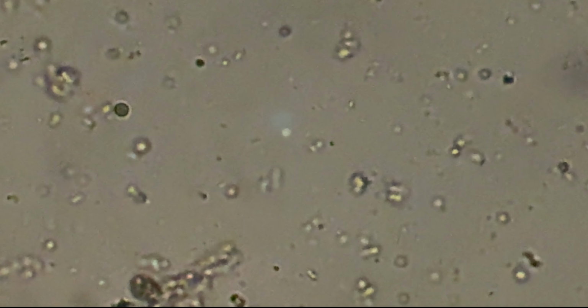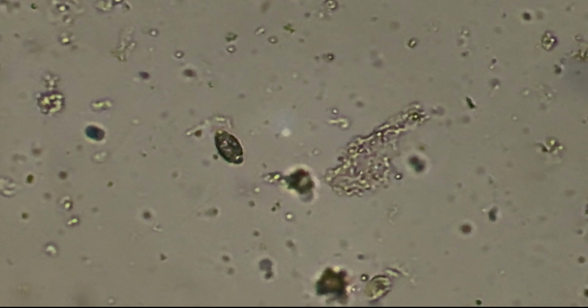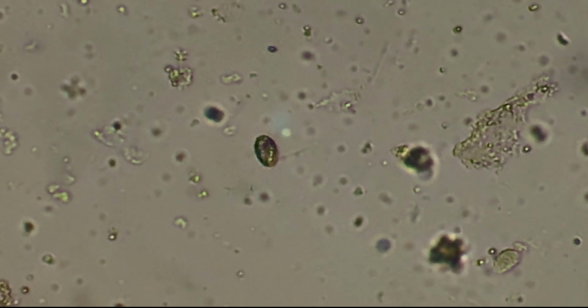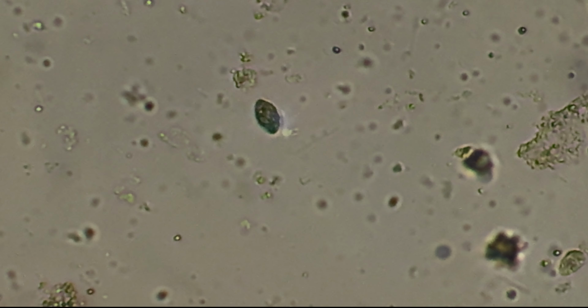I think that's what I love most about this kind of experiment. You don't need some crazy expensive lab to witness something incredible. You just need a microscope, some curiosity, and a willingness to ask a weird question like, what would happen if I did this?